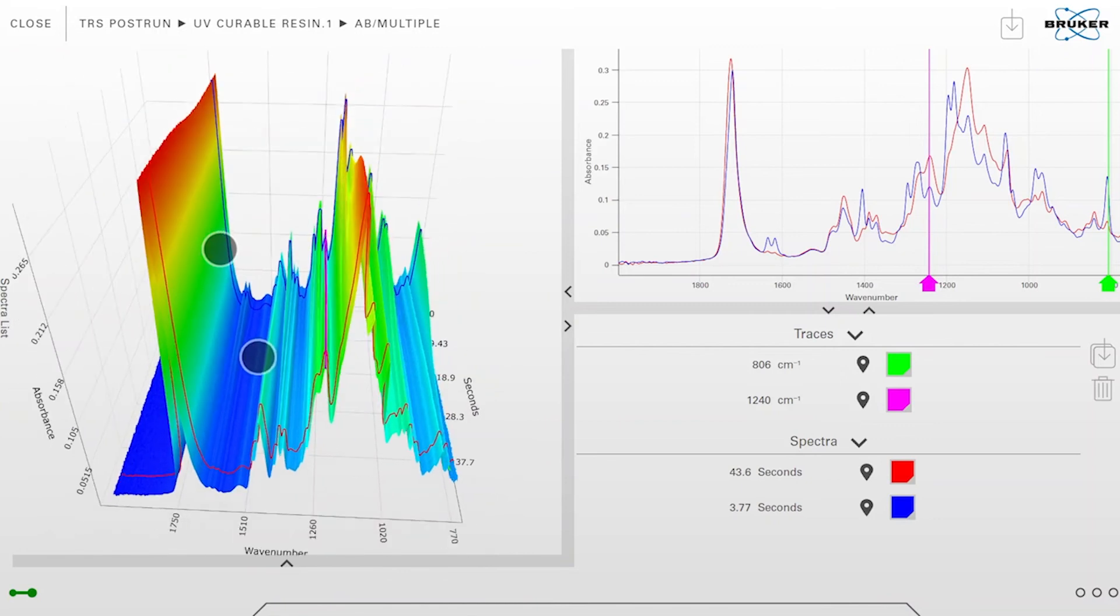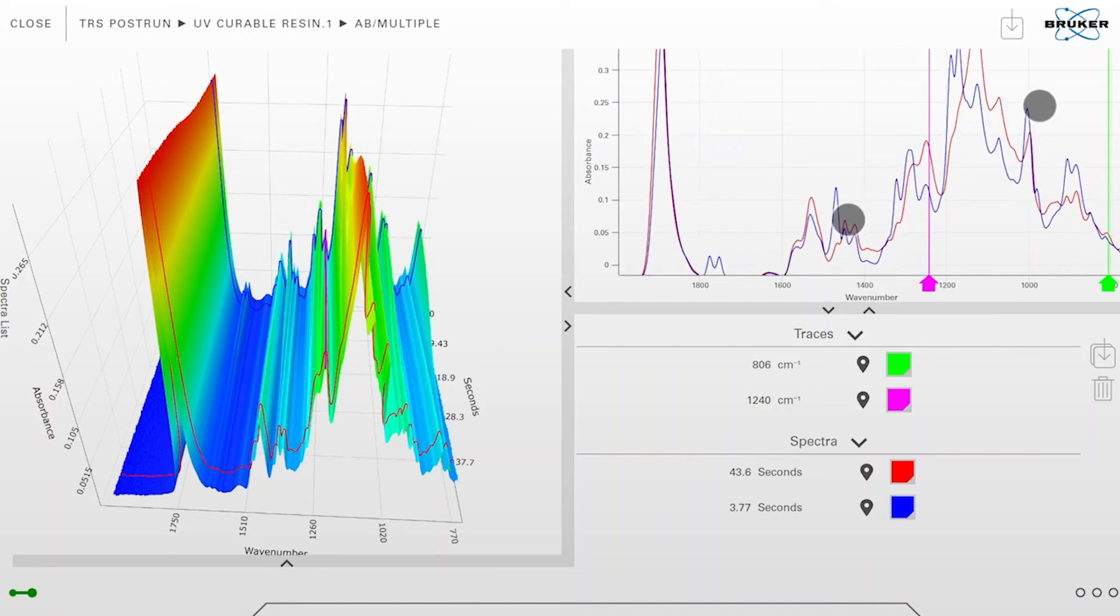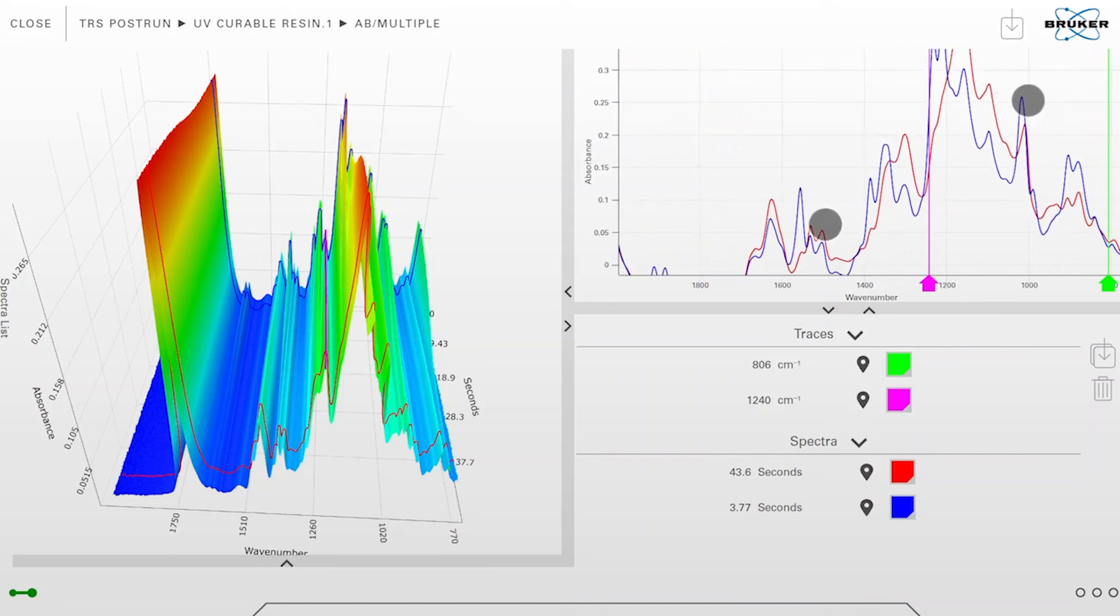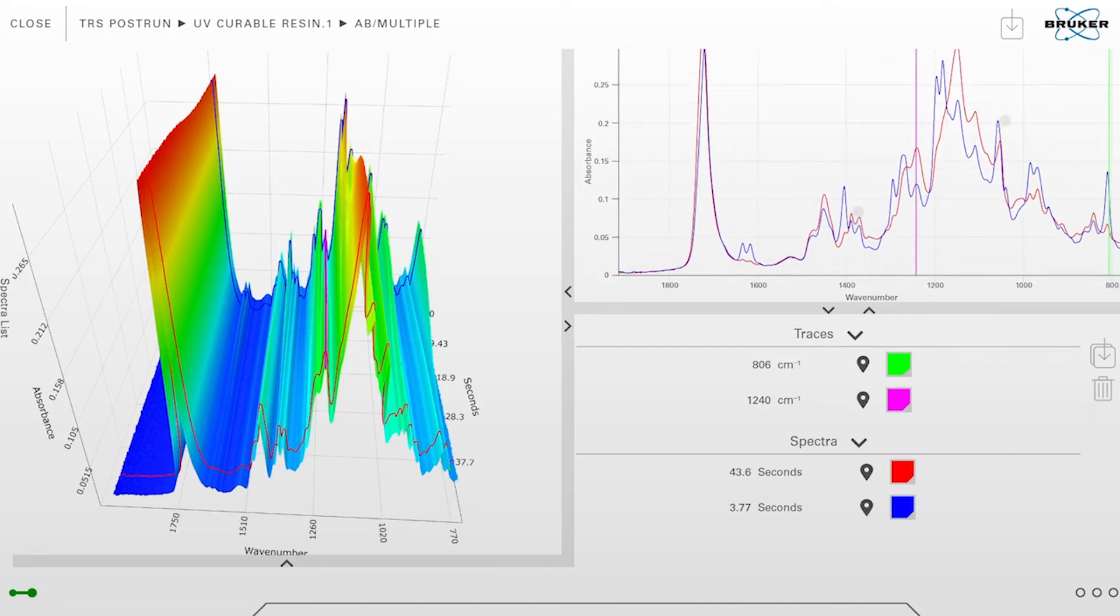The same can be done on the upper right corner with the 2D spectra. We can zoom in and zoom out or move it around.